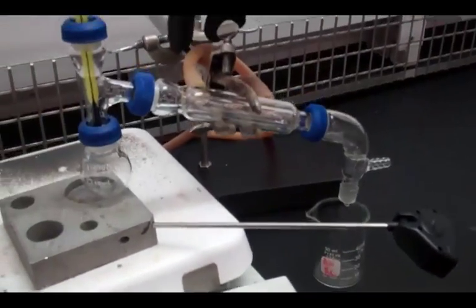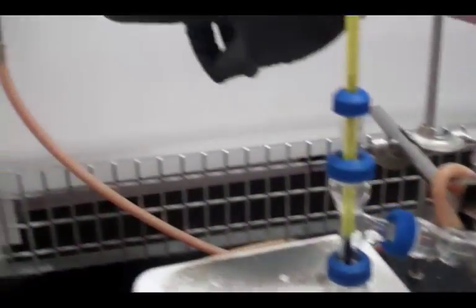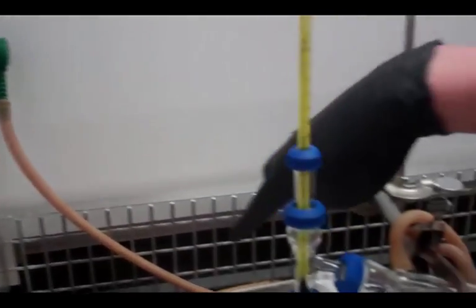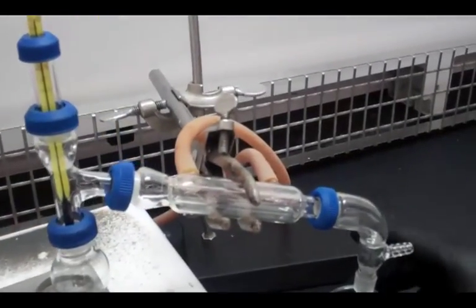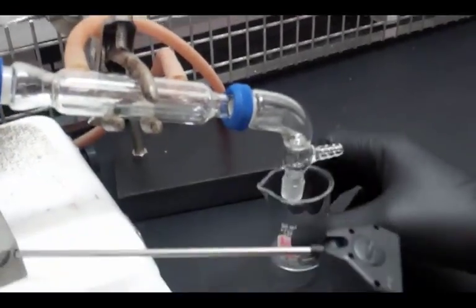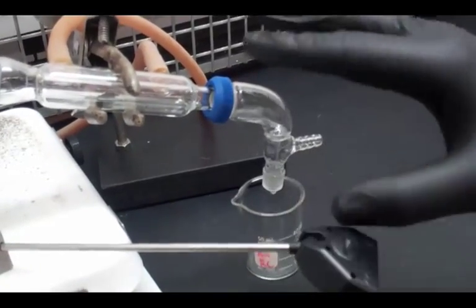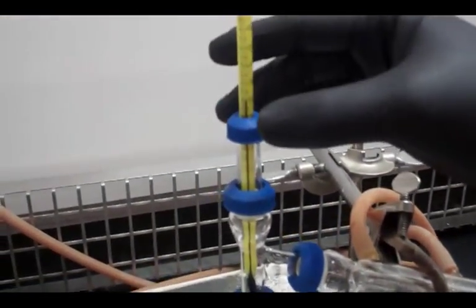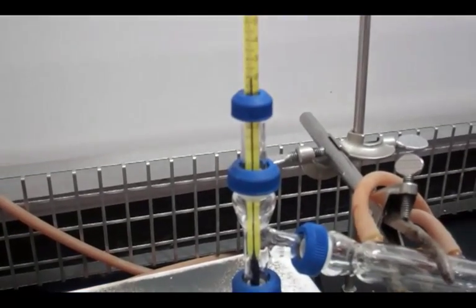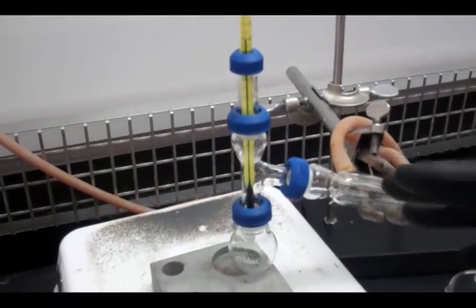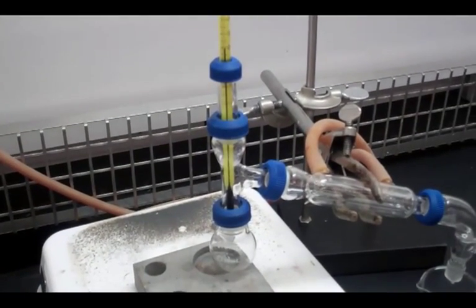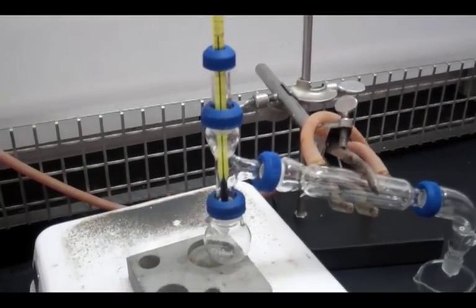So we have our two tubes here, one that goes into a water inlet right there and one that goes right down into the drain so it won't make a big mess. That comes down here into an elbow into a collection flask right here that we can collect our products. This right here, we have a thermometer there and that is just so we can monitor the vapor temperature of the vapors so we can tell which compound we are distilling at what point of the experiment.